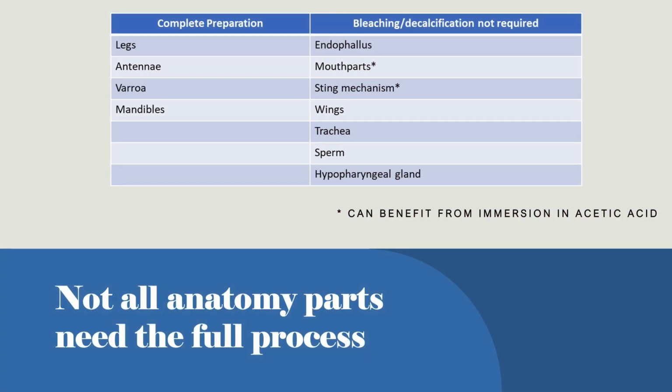So the complete preparation, then no one's written this down. This is the first time you might have seen it. No one's done this. Some require complete preparation, or from the beginning to the end, and some don't. So if you've got mouth parts or soft parts, things that don't have strong cuticle in them and don't need flattening, then you don't have to go through the first 3 or 4 days. And some of them benefit from acetic acid. I like to put it in acetic acid because basically it cleans the specimen up.